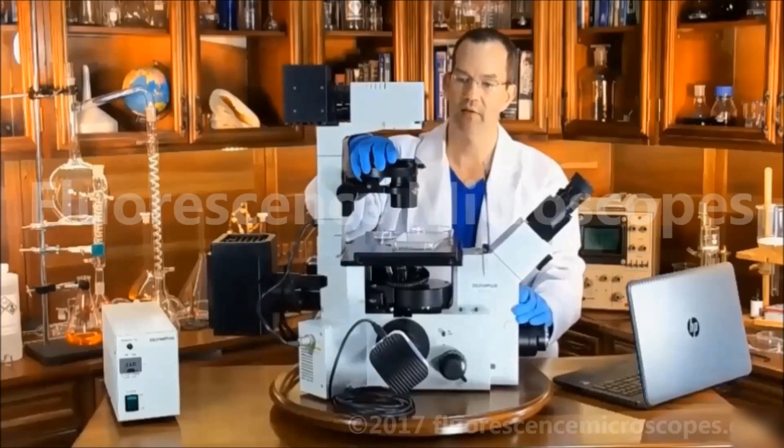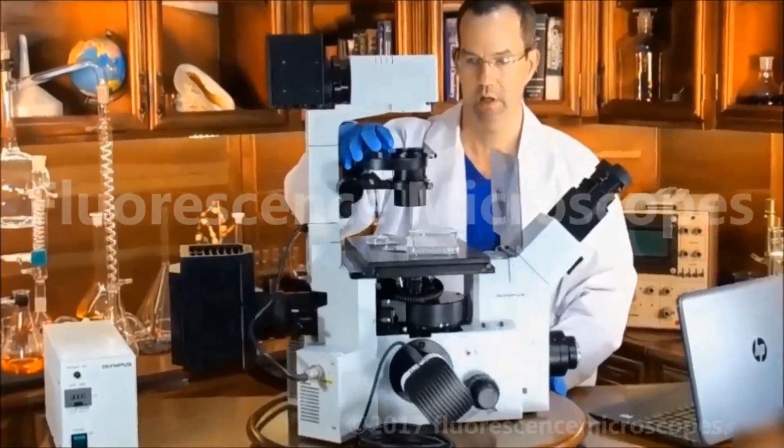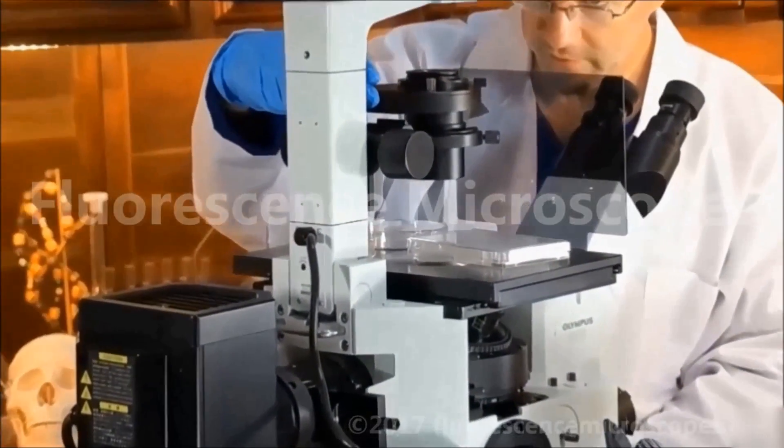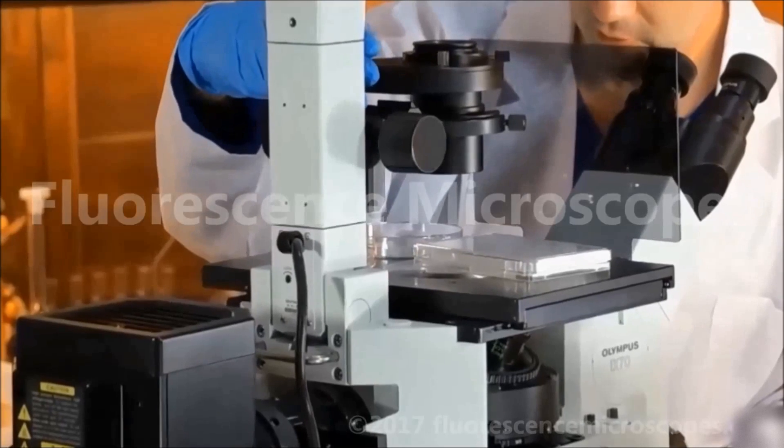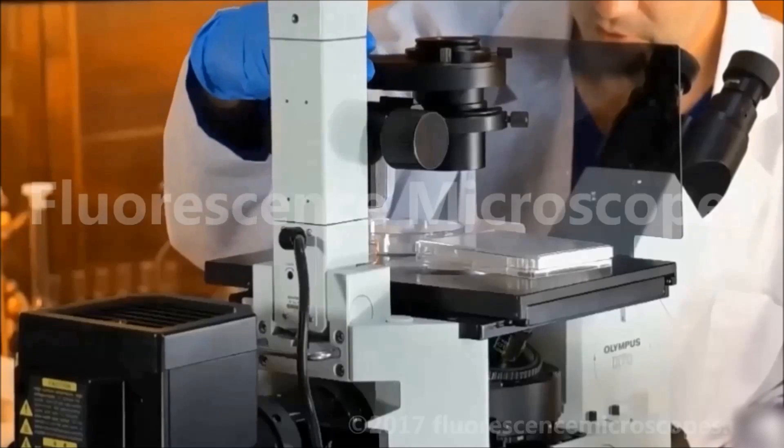This is the condenser. It has a phase contrast system. Particular ones are, it's got bright field, phase low, pH 1 and pH C, pH 2.